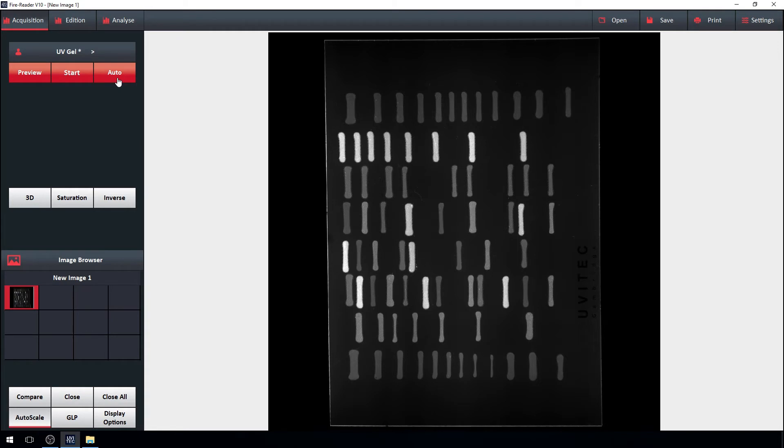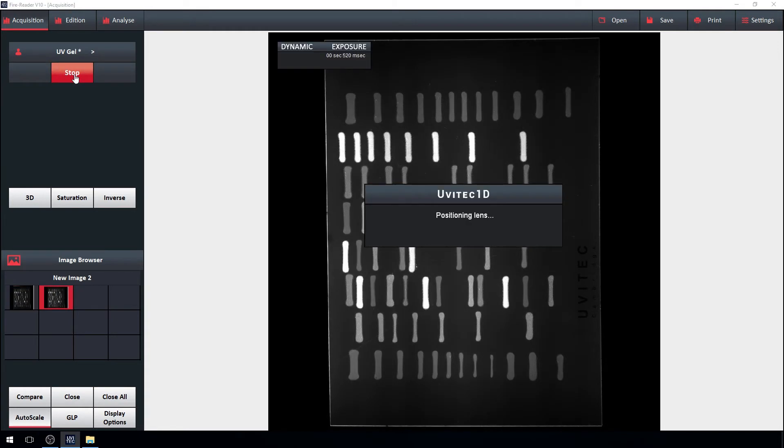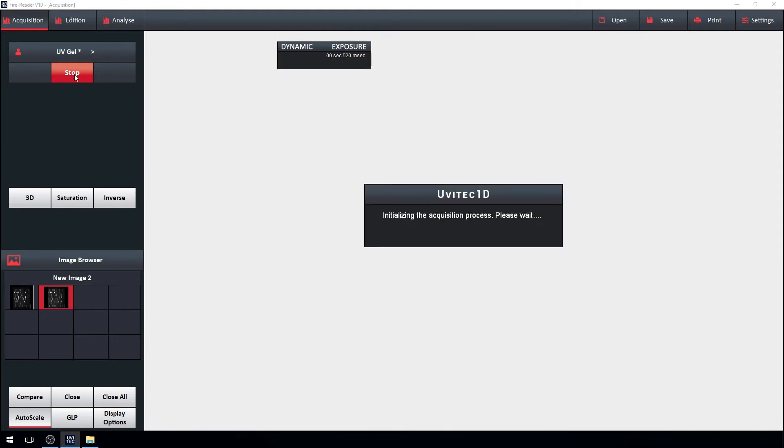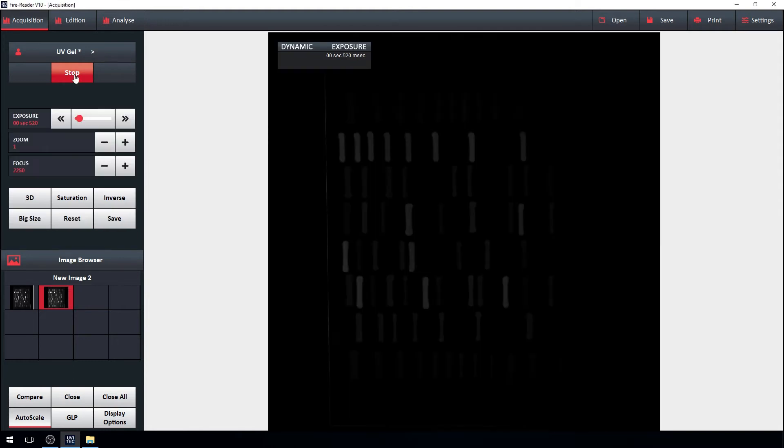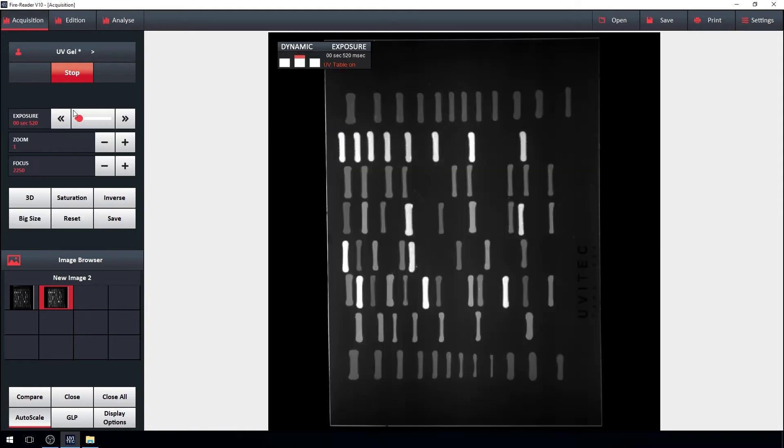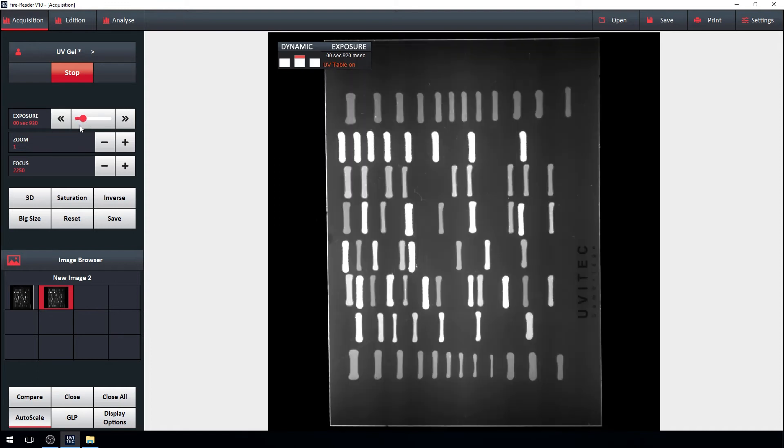Another way to go is live. The image on the right shows the band saturation according to a chosen exposure time. Increase or decrease the exposure time and visualize the effect on your gel straight away.